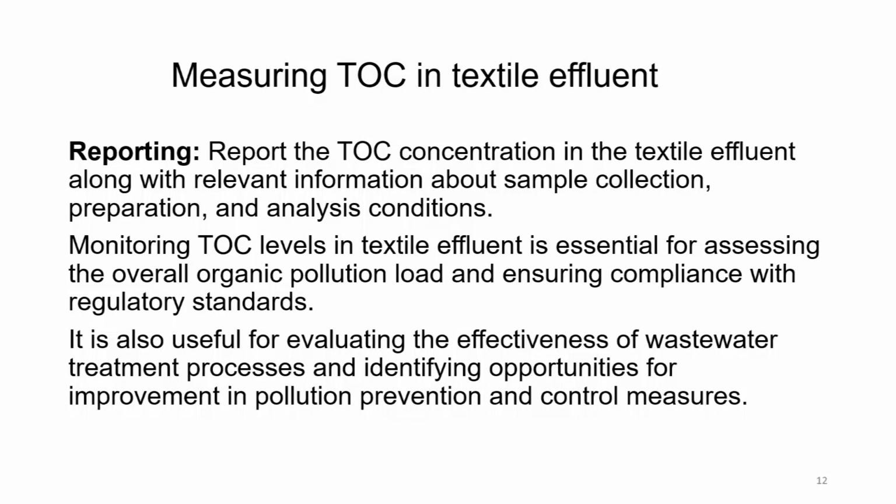Measuring TOC: reporting. Report the TOC concentration in the textile effluent along with relevant information about sample collection, preparation and analysis condition.